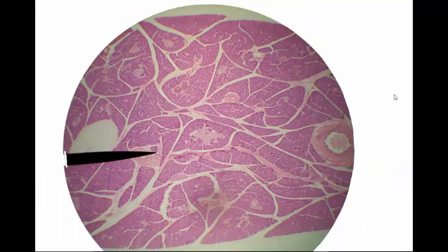This is another organ entirely. Here we're looking at pancreas. And there's a couple different structures I can point out in this lower magnification image. This area here you may remember from endocrine system. This is called the pancreatic islets. This is a pancreatic islet also known as an islet of Langerhans.